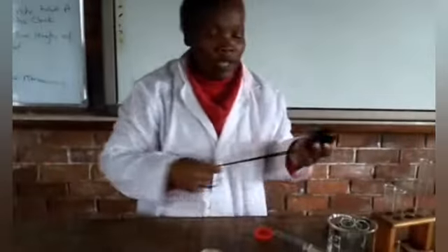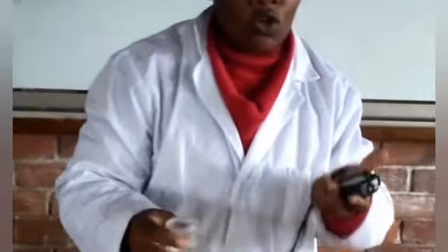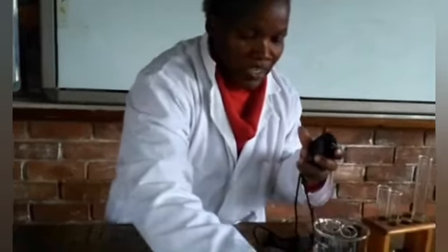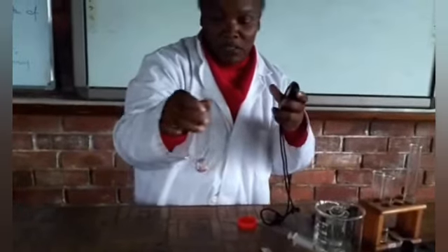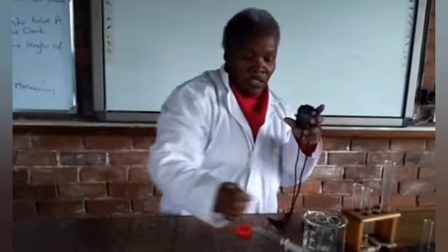And we said we want the reaction to last for 3 minutes. So I have my stopwatch here, and as soon as I'm pouring, at the same time I'll start the clock. So here we go, and there goes my clock. And I must swirl a bit so that I mix. Okay, completely mixed, immersed. So we are going to leave this for 3 minutes.